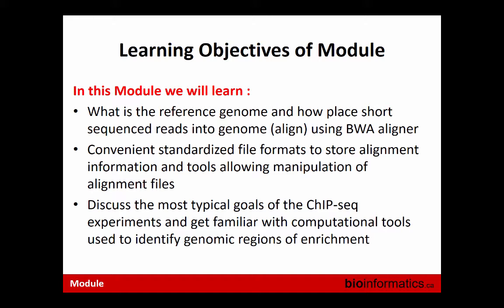But please see it as not analysis, but QC and analysis. And that's very important, because the fun part comes probably after what I'm talking about, but what I will be talking about is absolutely necessary in every experiment, because you want to be sure that what you're dealing with after, and do different interesting discoveries with, is data you trust and understand. That's the first. And I have a couple of disclaimers maybe.